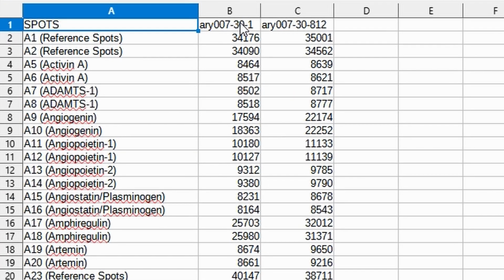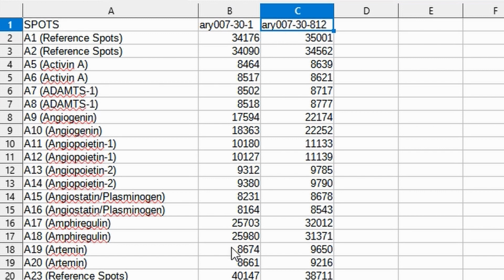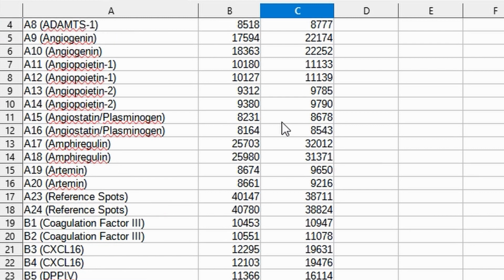And as you can see, we have the name of each data set with the values of the spots in the single column below. Each number is the average brightness of the pixels inside the corresponding circle. The numbers can range in value from 0 to 65,535, which is the range of a 2-byte integer in a computer. There's no particular significance to this numeric range, it's just the range that QuickSpots happens to use. What matters is the values of the spots compared to each other.